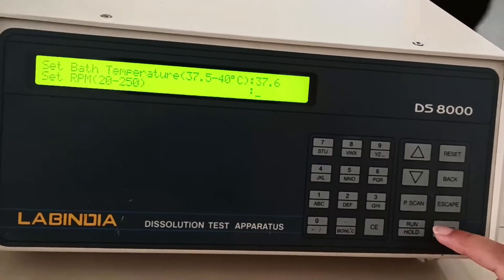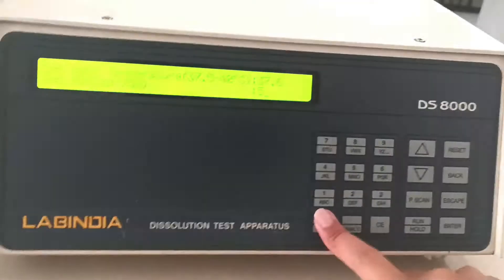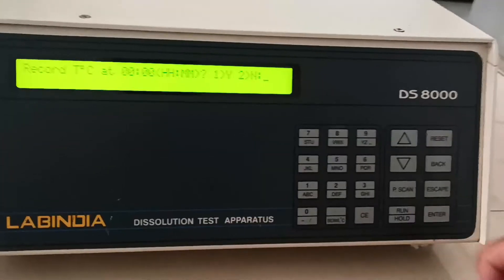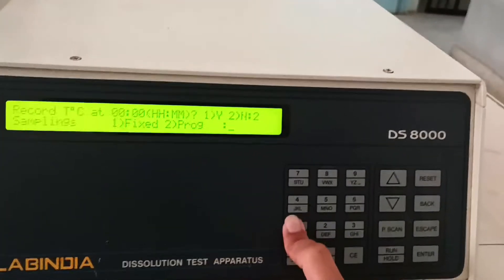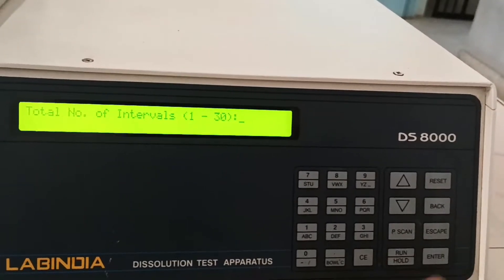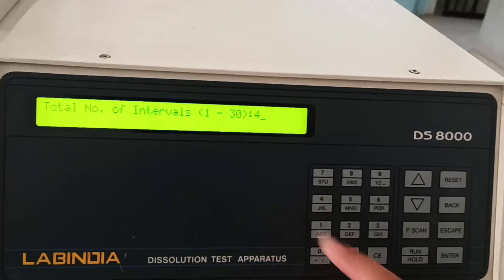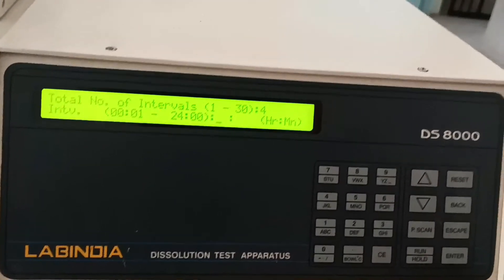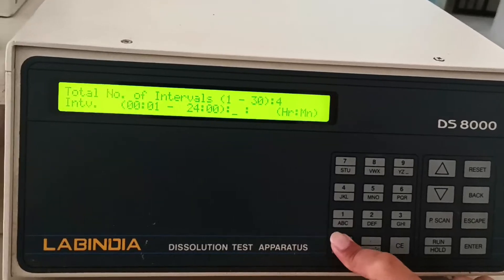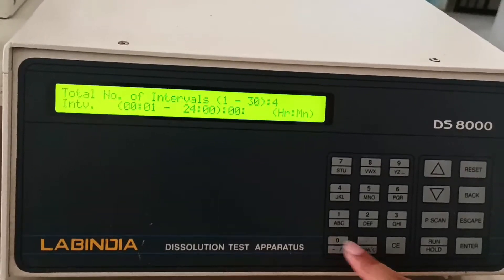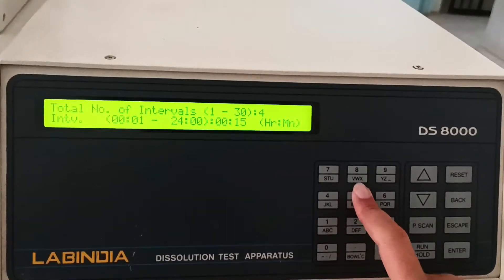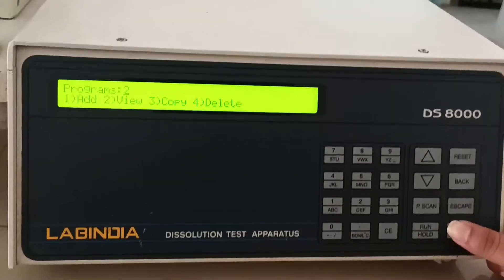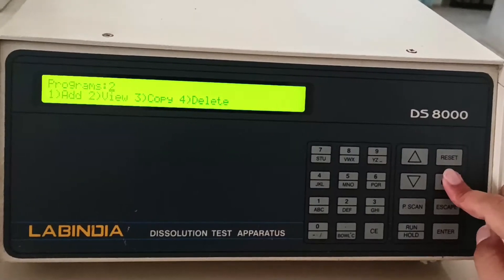Then set the speed - enter 50. Next, set the intervals - if you want four intervals, press four. For time, set 15 minutes as zero zero hour and 15 minutes. Press enter. Then press back several times to exit.